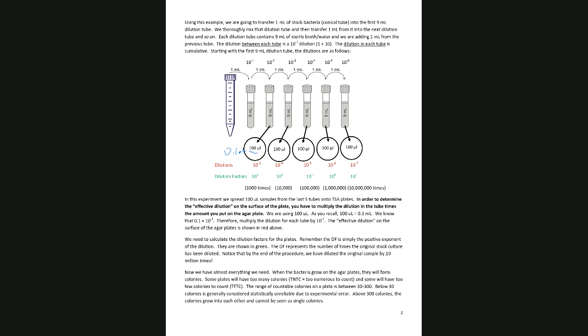So it's just 2 different ways to do it. You get the exact same number at the end. I like to do the dilutions up front so that I know what the dilution on the plate is. And that will simplify my calculation at the end. But that's only if you're using an amount that's not 1 milliliter. If it's 1 ml, then nothing changes, right?